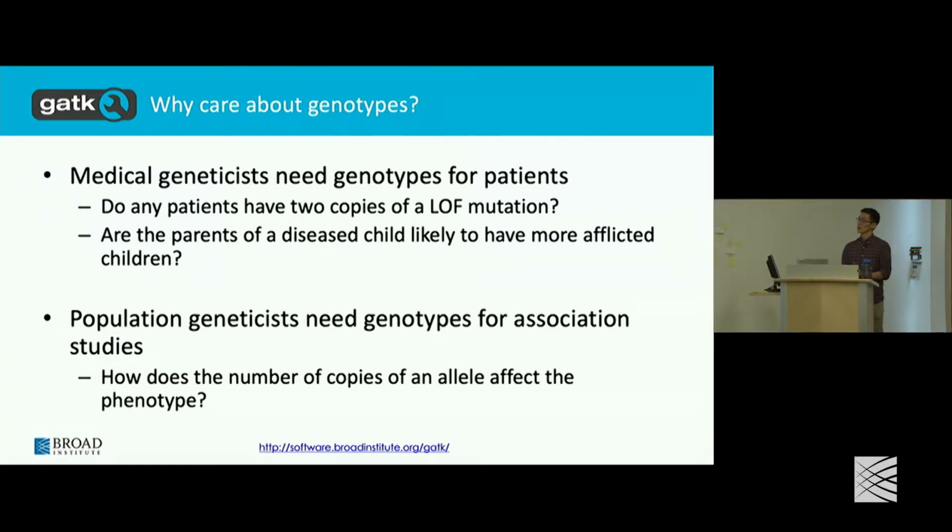Although I'm not a clinician, it is important to get those right. There's a huge difference between there being no variant, so homozygous reference, and there being a variant. But it is also important to distinguish between whether a genotype is a heterozygous or homozygous variant, whether there's one copy of each allele or two copies of the variant allele.